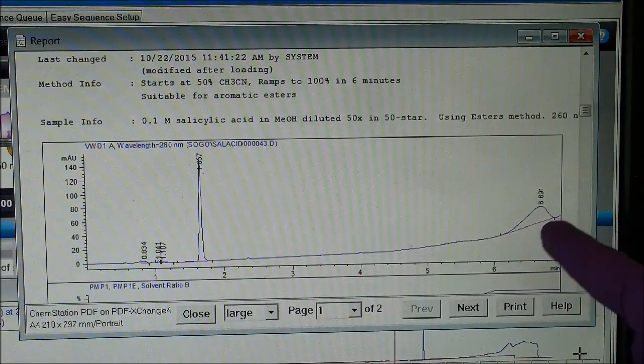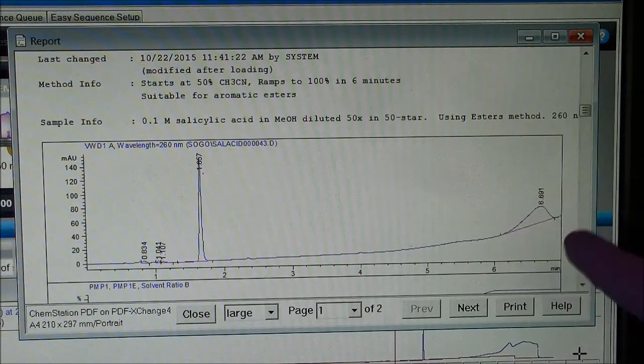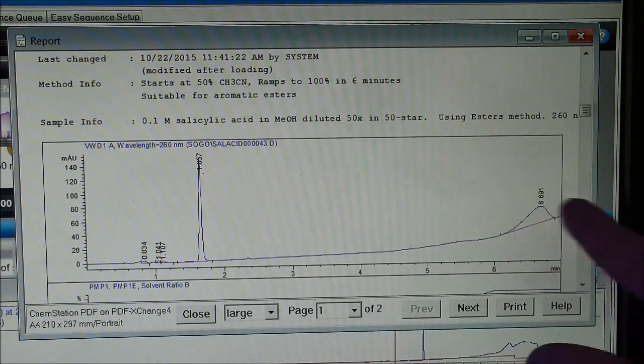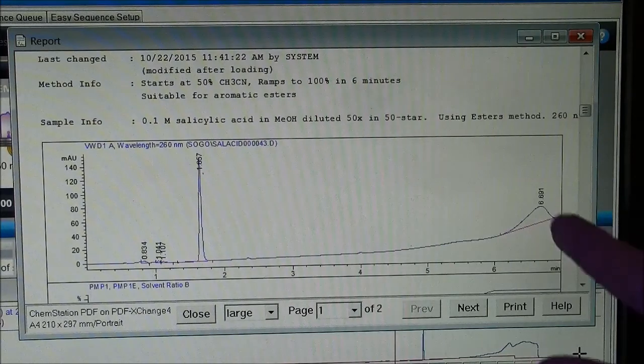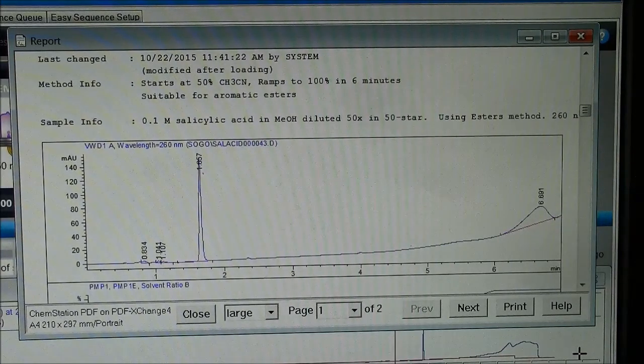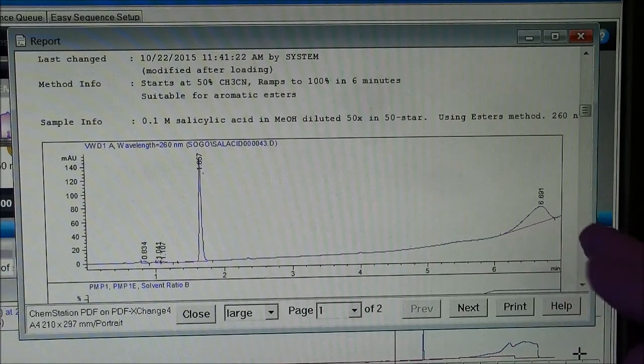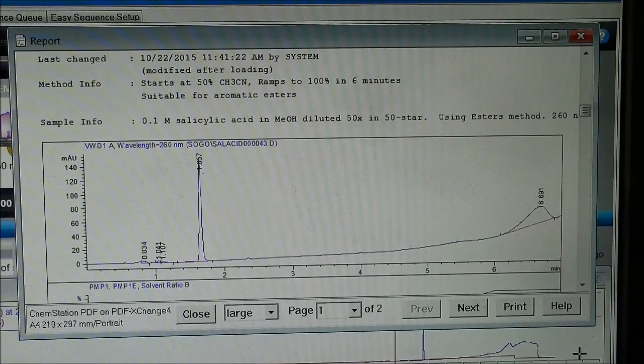This is odd out here. This is some other molecule that's coming out very late in the gradient. And that's some contamination there.